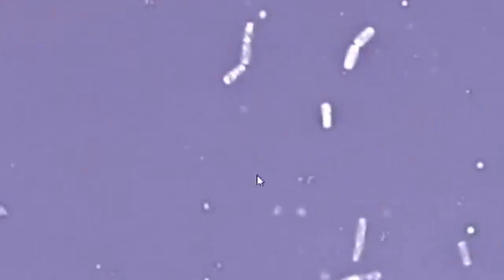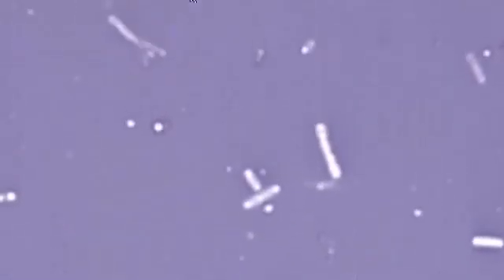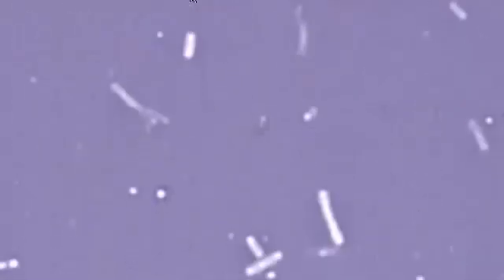Now you can see this is a perfect image for a bacillus. Short fat rod, one right here as well. A bit of a streptobacillus going on here and here, but that's perfectly fine. Let's move around a bit. Here we go. Here's a better look. Let's take a look at that. Oh, that's beautiful.